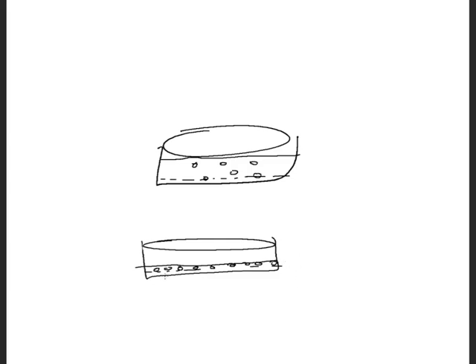Now this lends itself to drying out. So this is why usually a good rocker in the incubator is used, to make sure that this is just staying right on top of the cells. Otherwise the middle tends to get dry, the cells die, and you really only start to see transformations along the edge. So it's one of those things that you've got to be particular about doing.